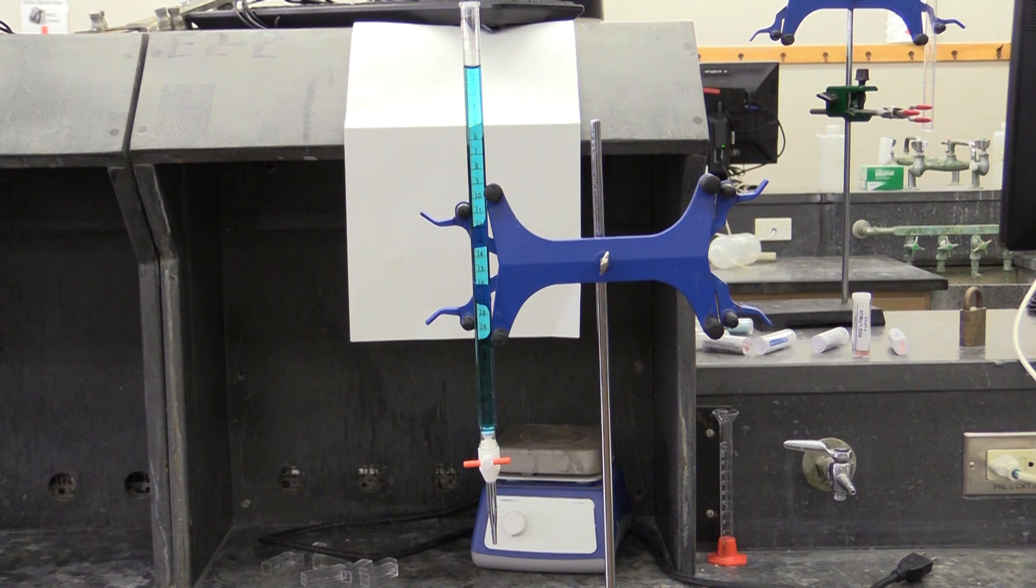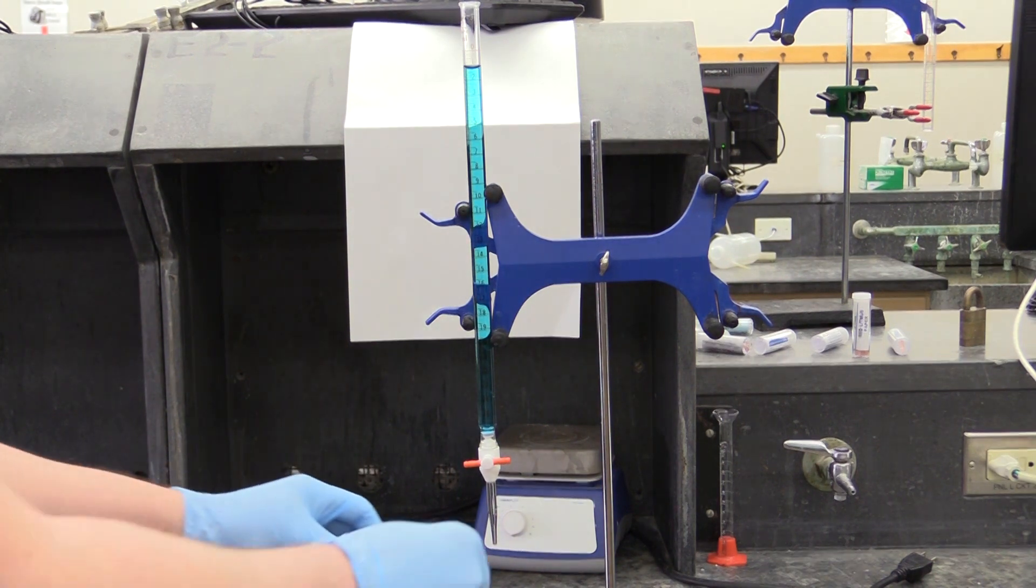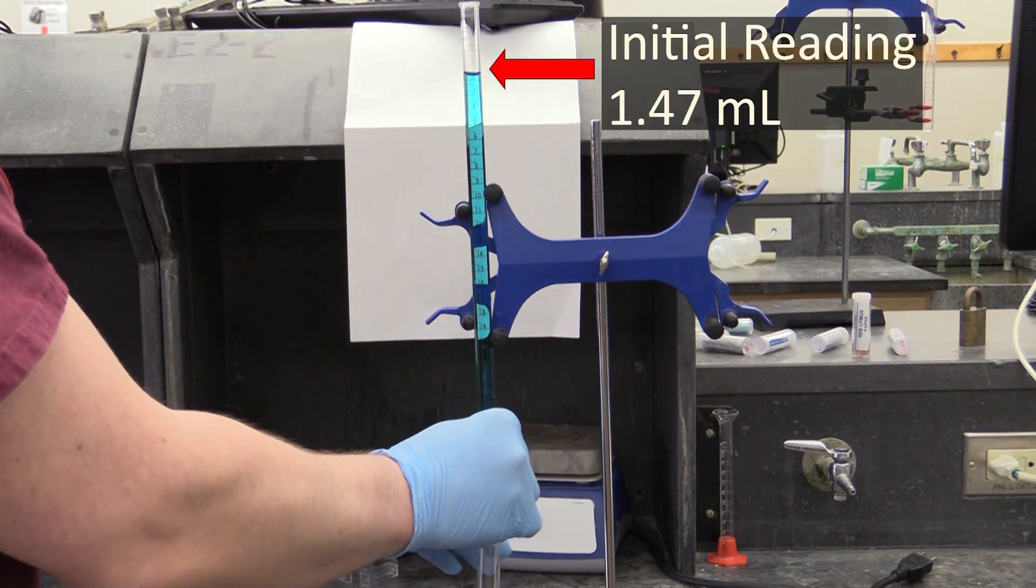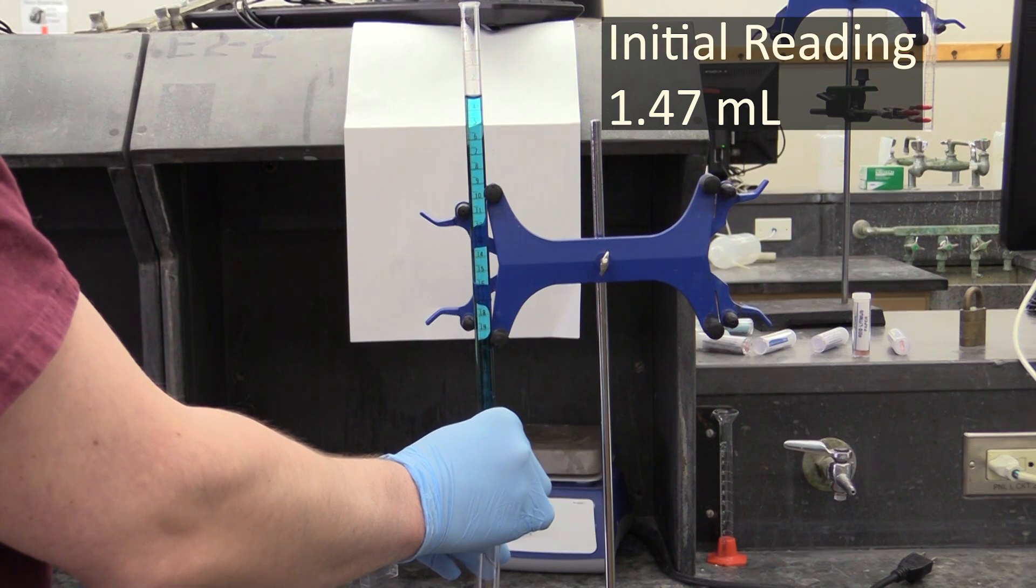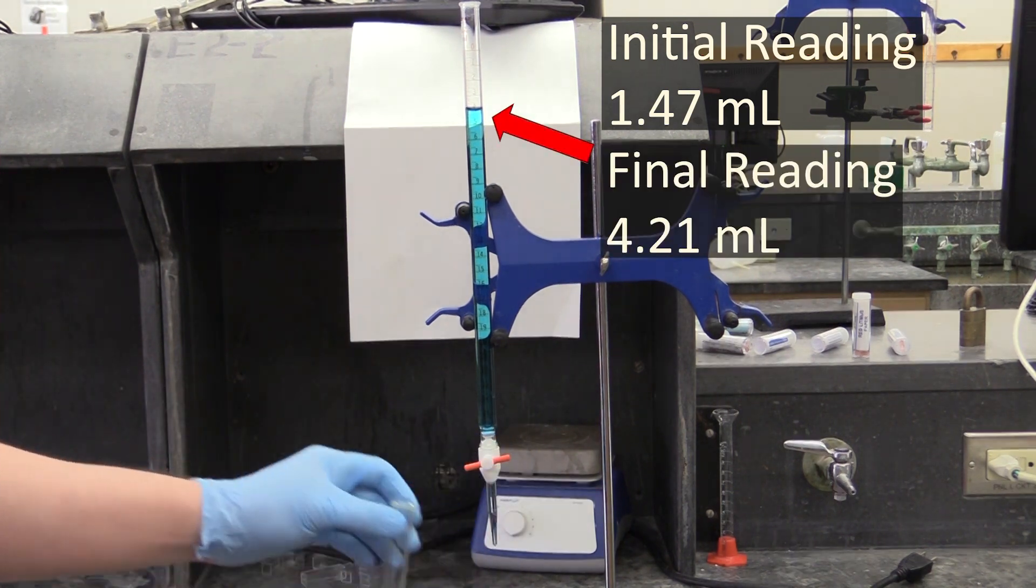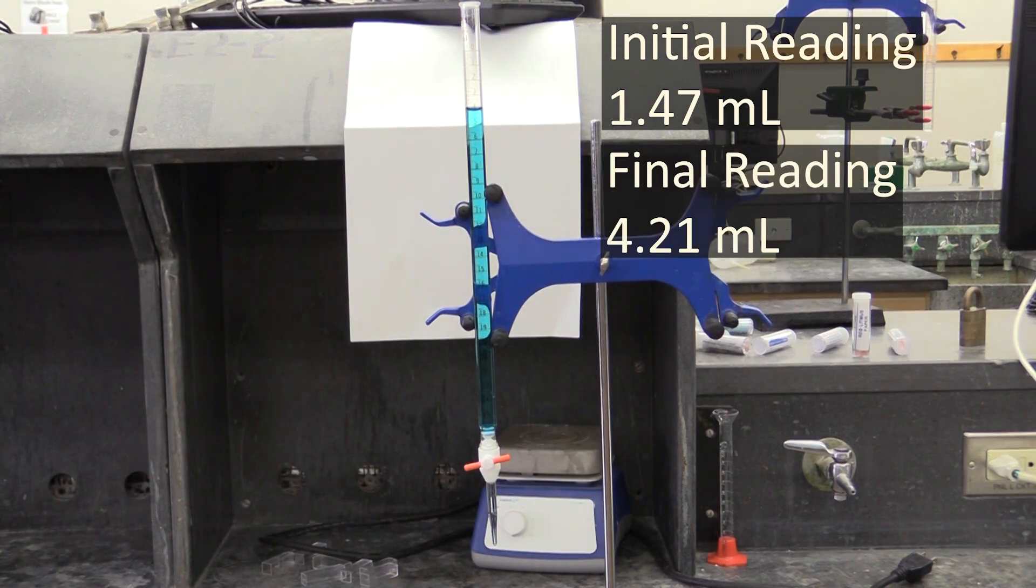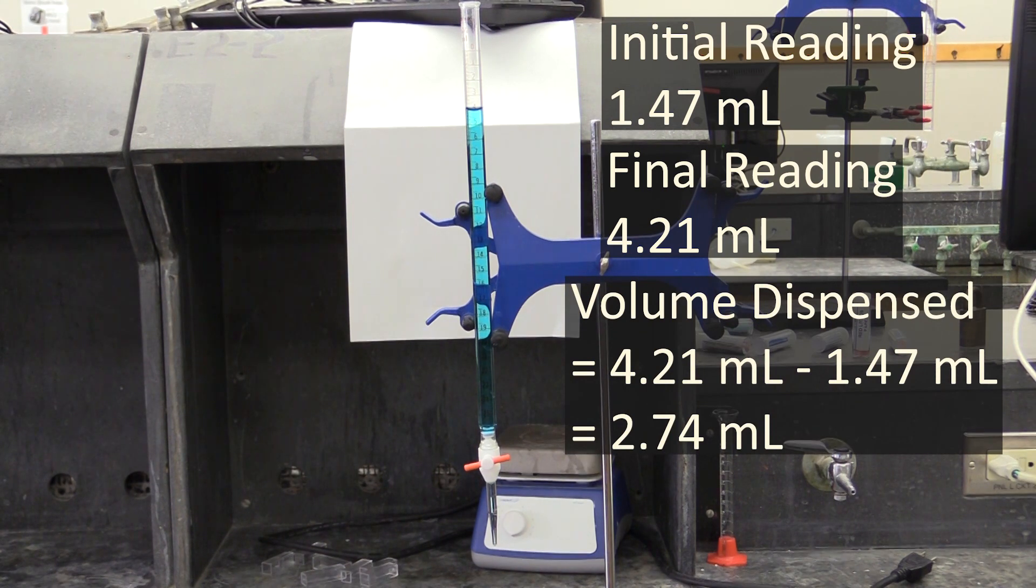To determine how much liquid you dispense from your burette, you will first take an initial reading before you dispense anything. Once you reach your titration's endpoint, you will then take a final reading. You then calculate how much solution you dispensed by subtracting the initial reading from the final.